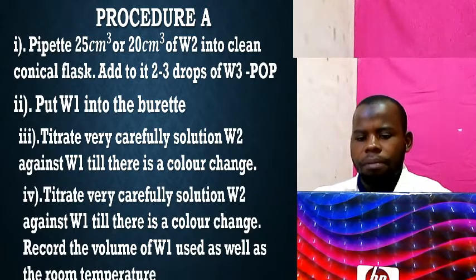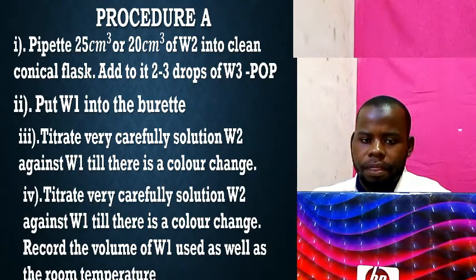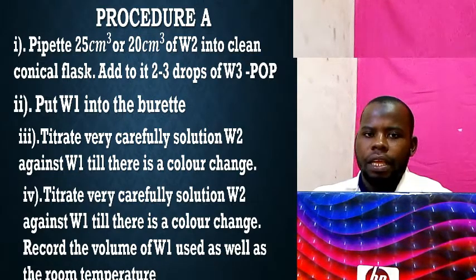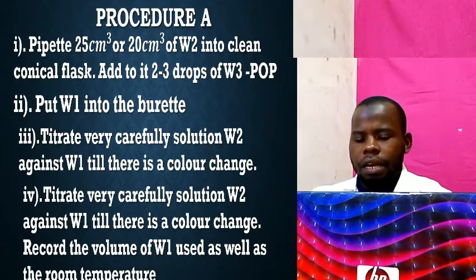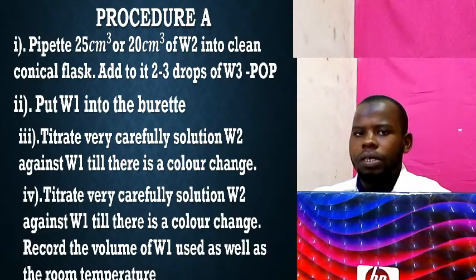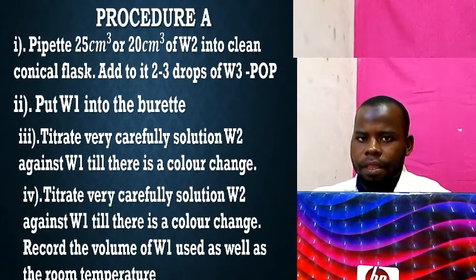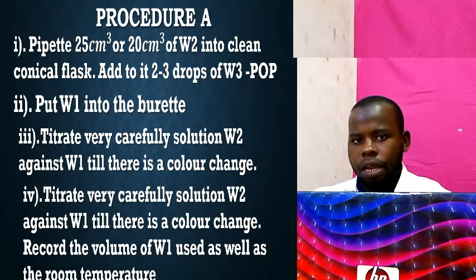So for procedure number 1, or procedure A, let's go to the laboratory to see how this can be performed and what results we are going to get. Let's go direct to the experiment. You will see and you will understand.